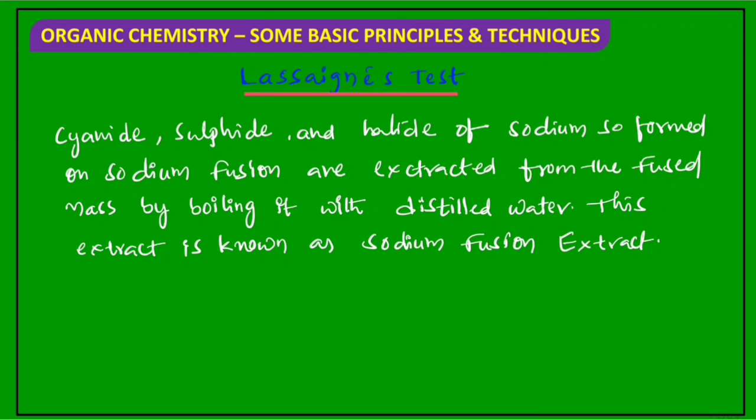In Lassaigne's test, the cyanide, sulfide and halide of sodium formed on sodium fusion are extracted from the fusion mass by boiling it with distilled water. This extract is known as sodium fusion extract.